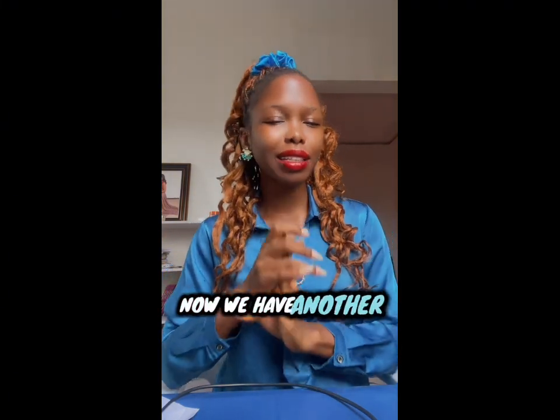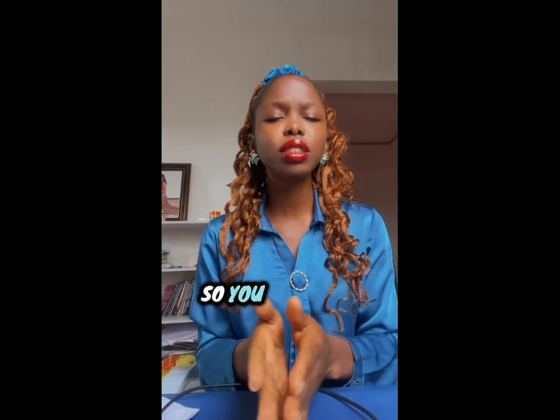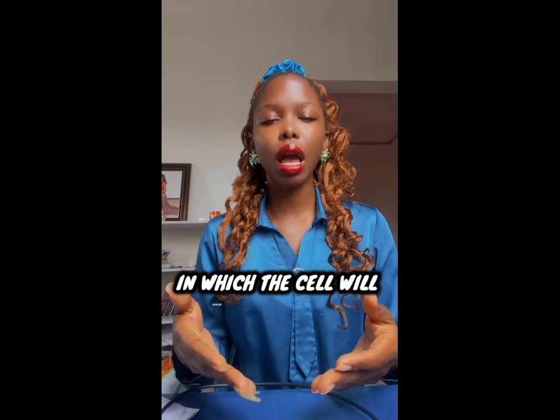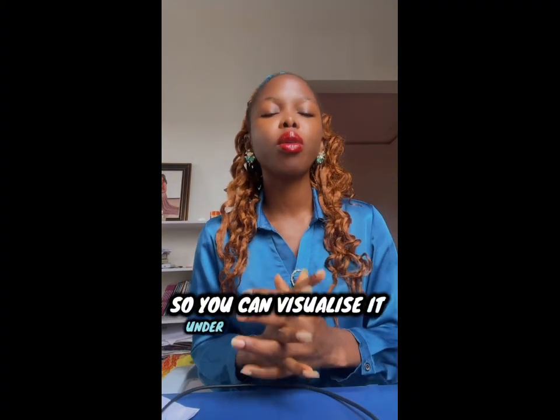Now we have another stain, which is the negative staining, where you just stain the background. It's used for cells that are sensitive to dyes. So you stain the background and you place the cell there, in which the cell will appear transparent against a dark or stained background, so you can visualize it under the microscope.